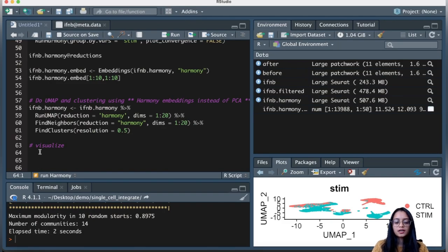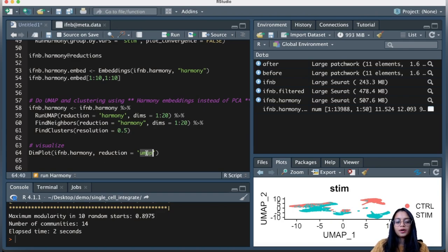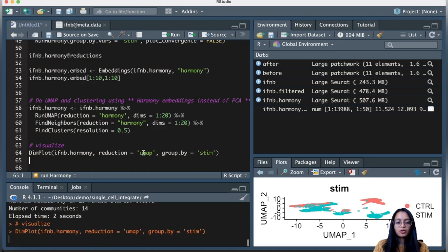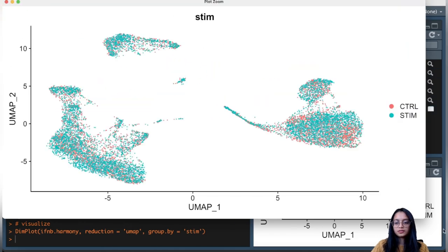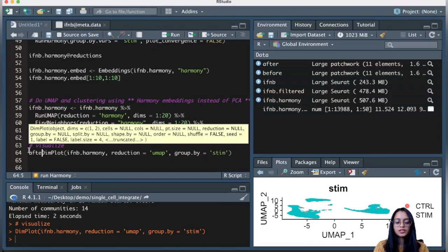Now that this has finished running, let's visualize the data using a dimension plot with the harmony object. The reduction used is UMAP — this UMAP was calculated using the harmony reductions, so it's the updated UMAP. We group cells by condition from the 'stim' column. Zooming in, cells from both conditions overlay well over each other and do not separate out by condition — exactly what we wanted from integration.